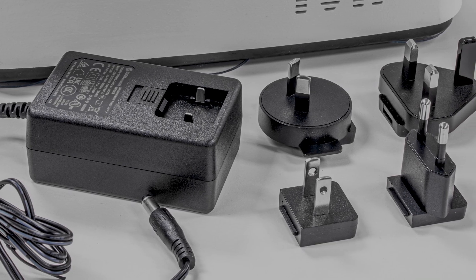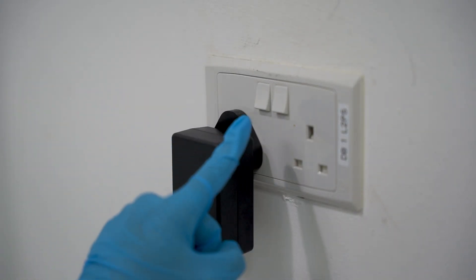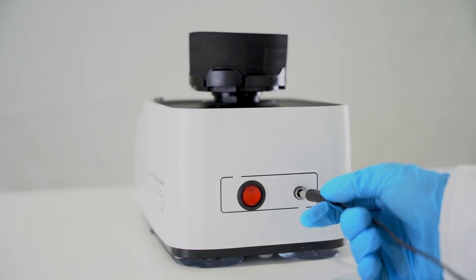Select and install the correct power head that suits your country's requirement before plugging it into the wall socket and powering the machine on.